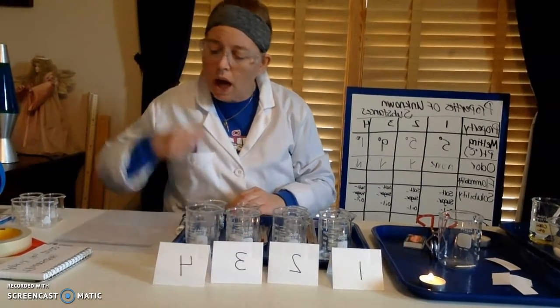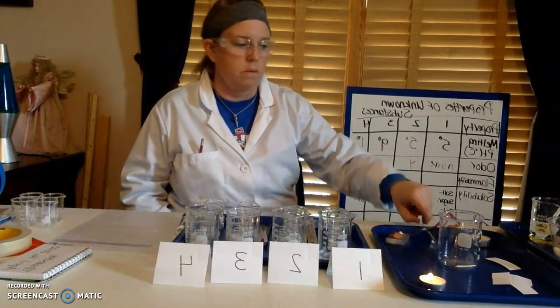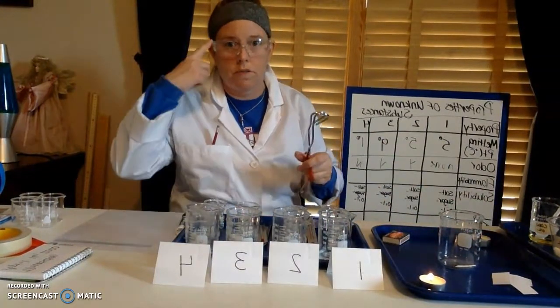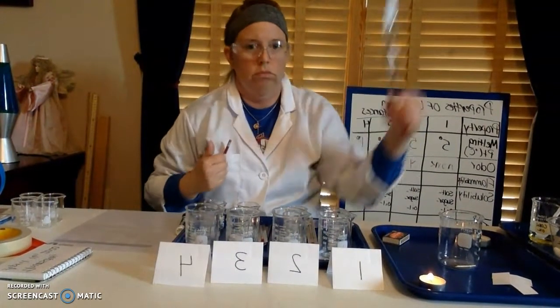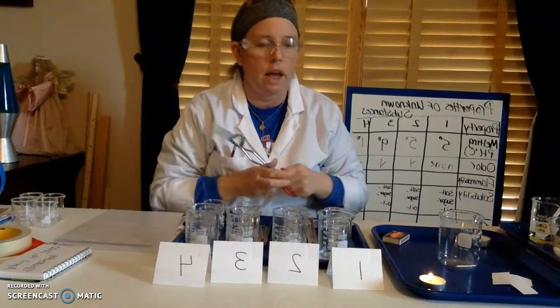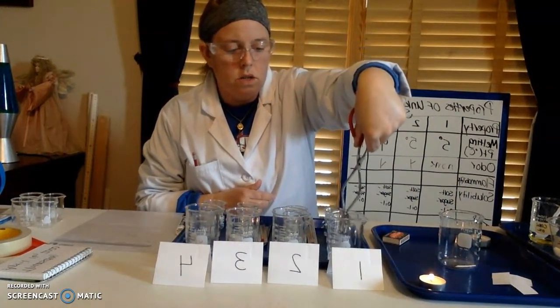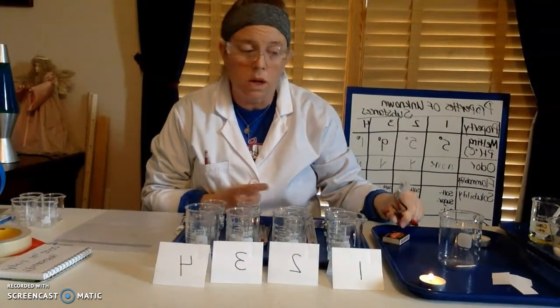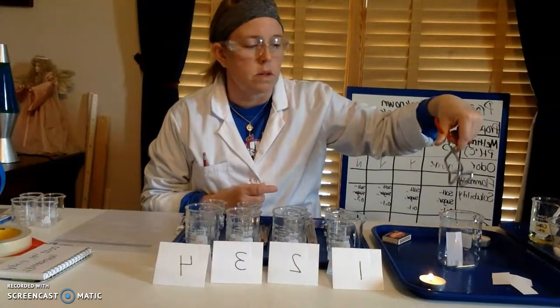All right, moving on to the next thing, flammability. Everybody loves that one. So obviously, I have my safety goggles on, I have my hair back, sleeves up, and hopefully you can see my candle here. I'm simply going to place this into each of the liquids. This is liquid 1. And again, we're going to see its flammability. So we're going to see if it catches fire. And you can tell that one. That's number 1, no.